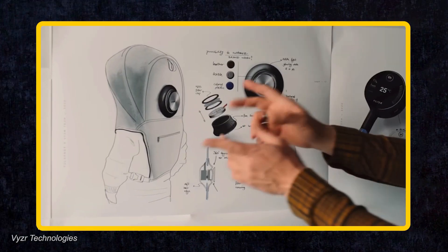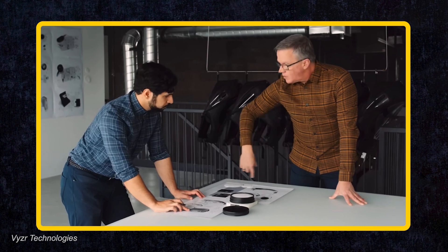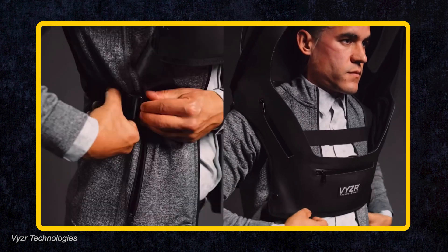I always wondered if it actually worked. There were a lot of crappy projects going on at the time that you couldn't trust, and yet this one is rather nicely made. The marketing was terrific, so it seems like this has a chance of actually being a functioning powered air purifying respirator. But was it? The reason I'm questioning that is because making powered air purifying respirators and any respiratory protection equipment is kind of tough, and the details matter. Let's take a look at some of the odd details.